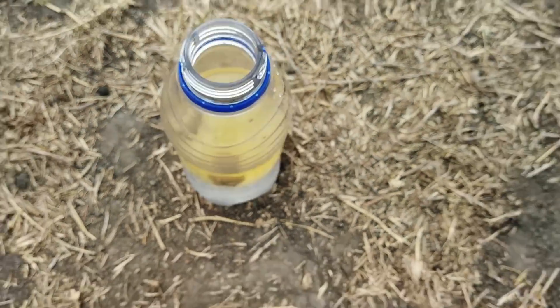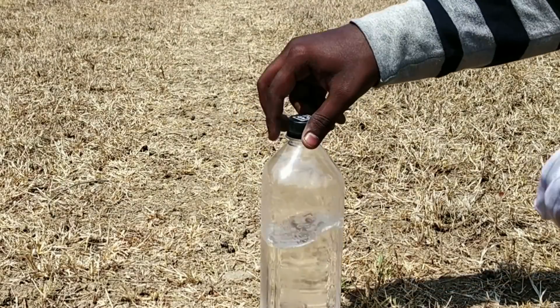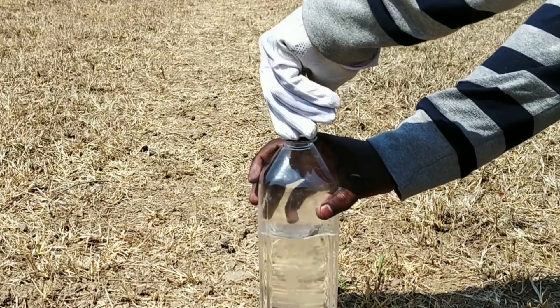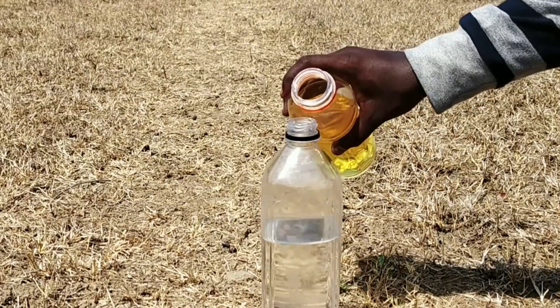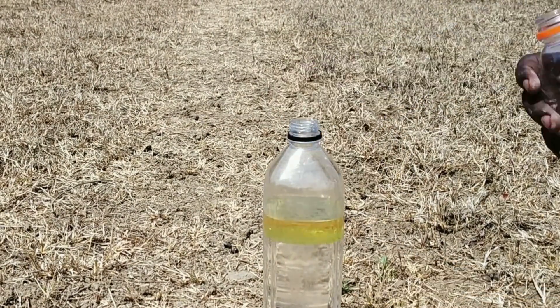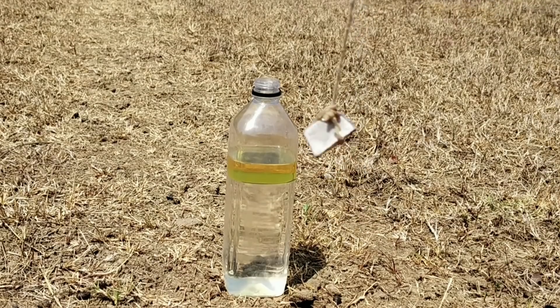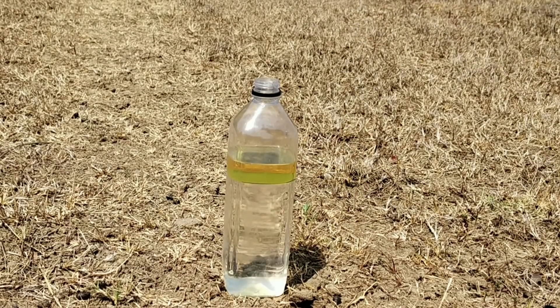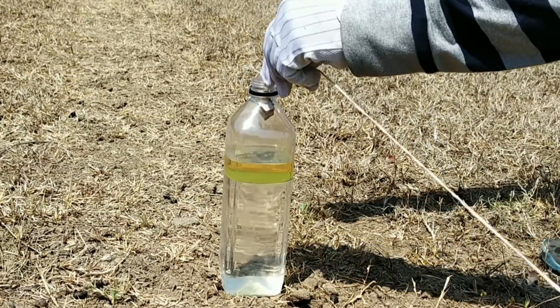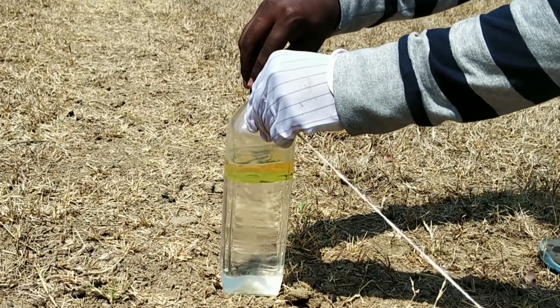Now let's try this experiment again. Now let's put some water in it, then some petrol. Put a piece of sodium in it, then let's add some water. I put a little bit of water in it.